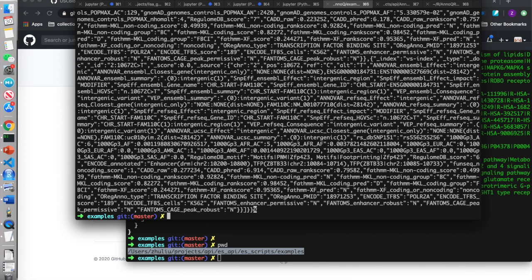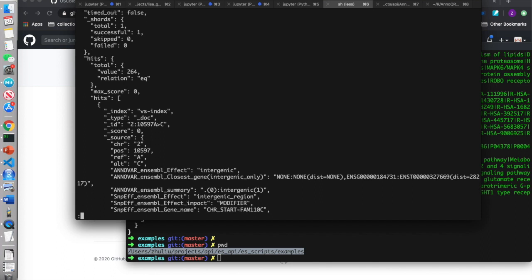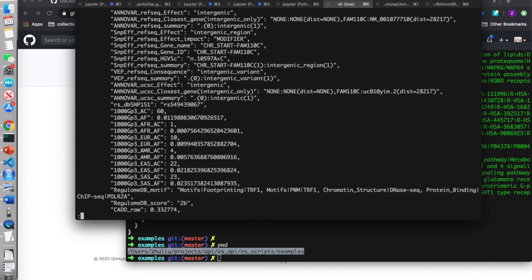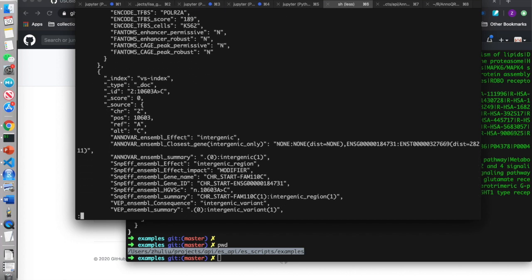So you will see the response. And if we use some software to print those responses in a more readable way, you will see it has some fields stating the status and the time used for this query, and then following all the data was in this hits field. Each one has all of the annotations in this data set, because we didn't specify which column we want.